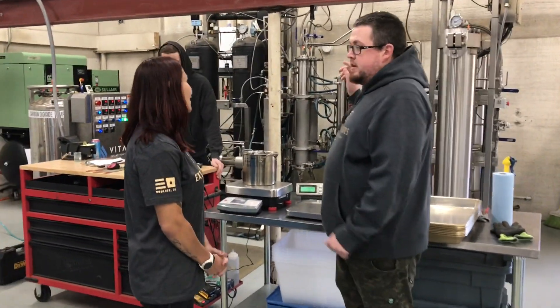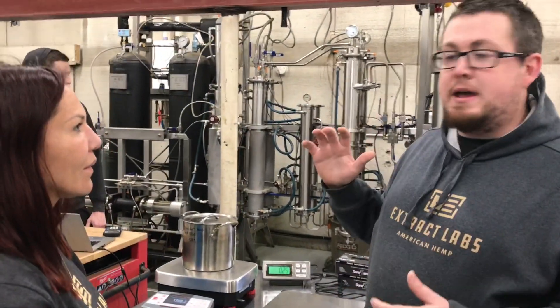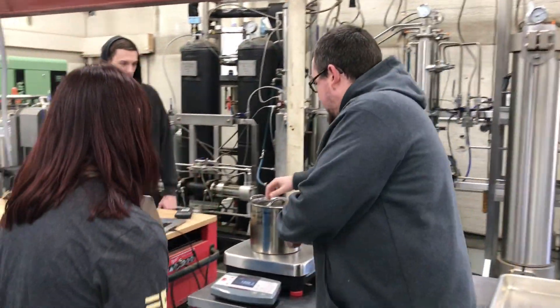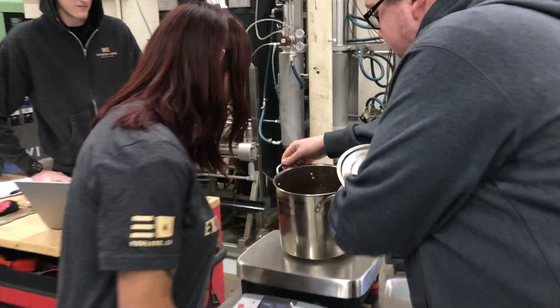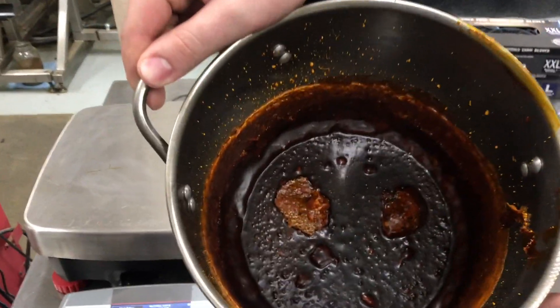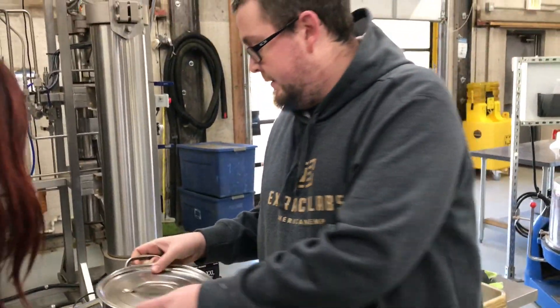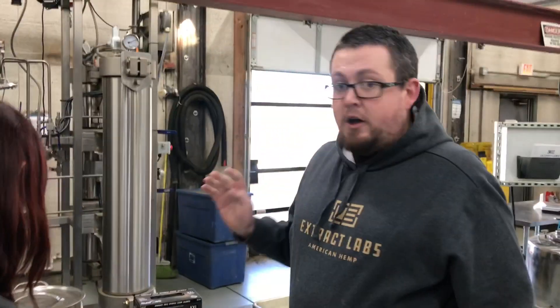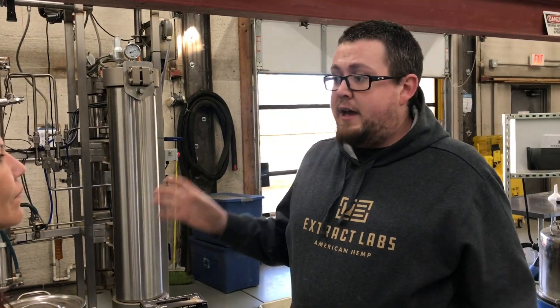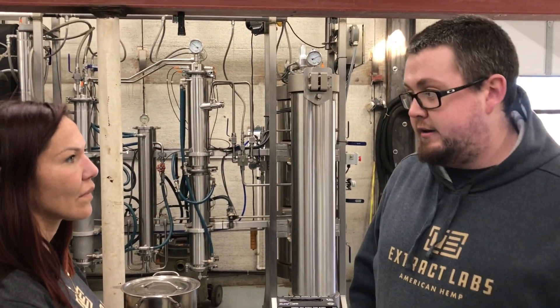This is our CO2 machine. This machine uses carbon dioxide to strip all the oils out of the actual plant material. When it comes out of the machine, this is what raw CO2 extract looks like. This is just the oil mixed with chlorophyll, some lipids, a little bit of plant material. That is all done strictly using carbon dioxide as a solvent. So it's very safe, very easy, very nice quality oil. We only use CO2 extracted oils in our products.